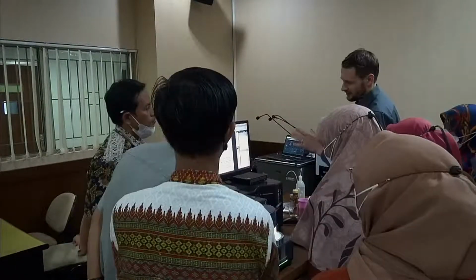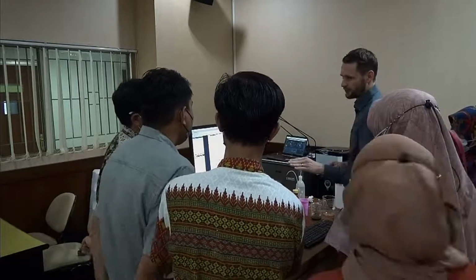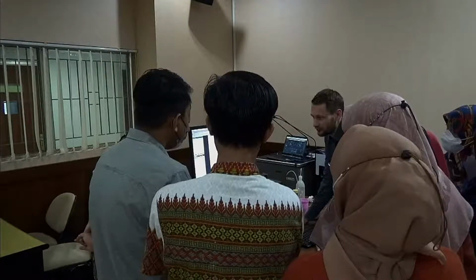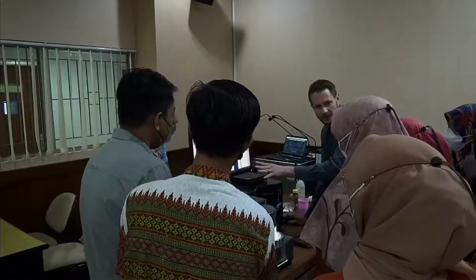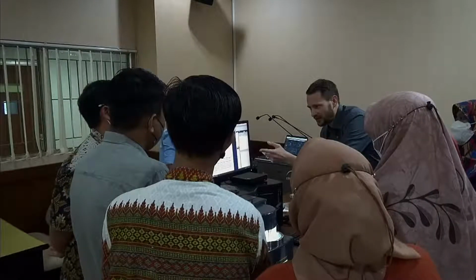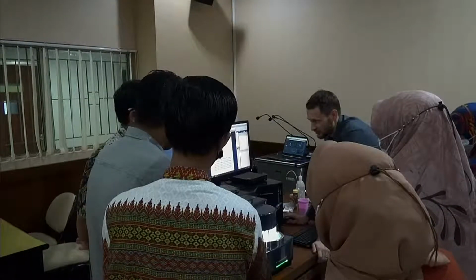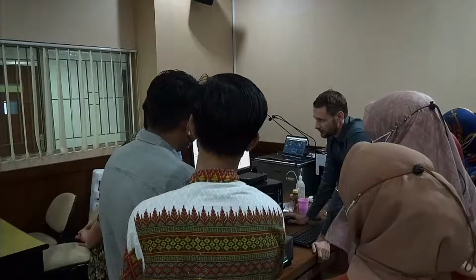And as I said, you can really change and edit the reports in any way you want. So for anybody who's good with IT, that's a good opportunity to really customize this. This is the most basic one, but at the end of the day, I got my measurement in 3 seconds. I got my PDF, which I can save, which I can send. So I think those are the most important things that you can do.